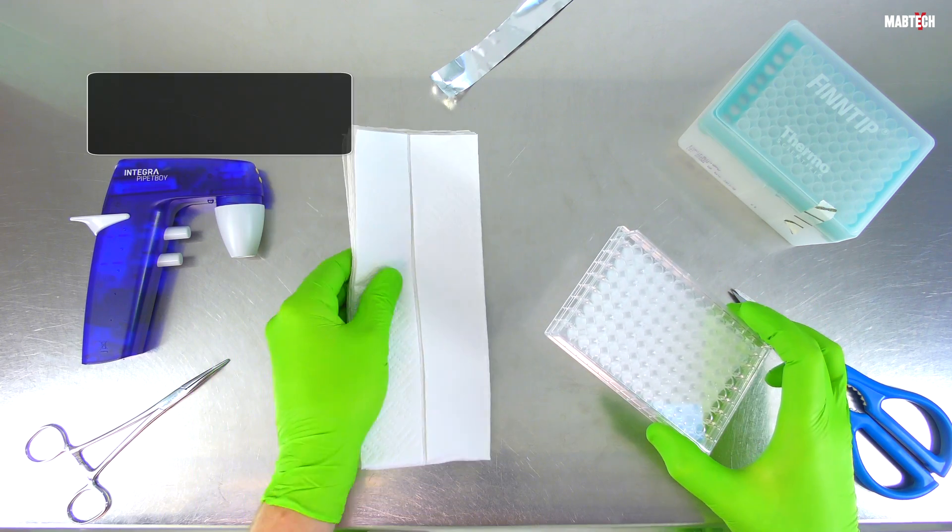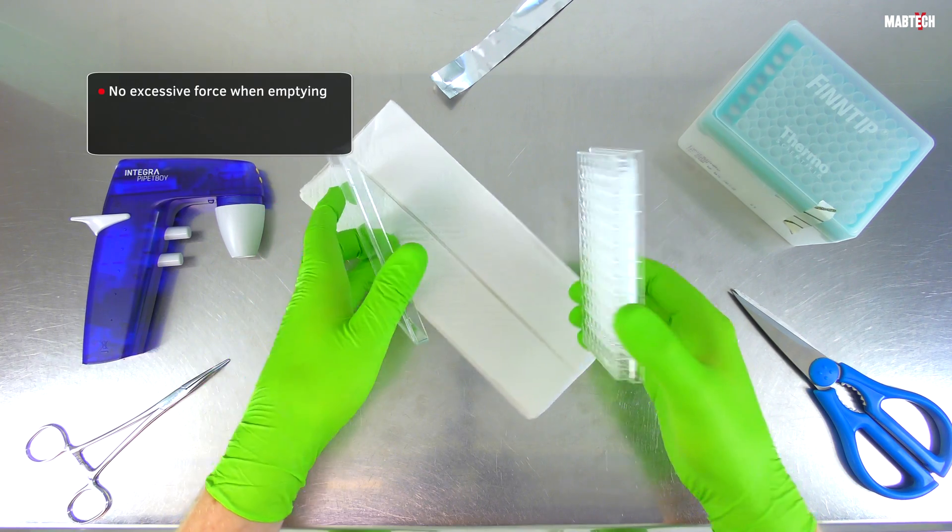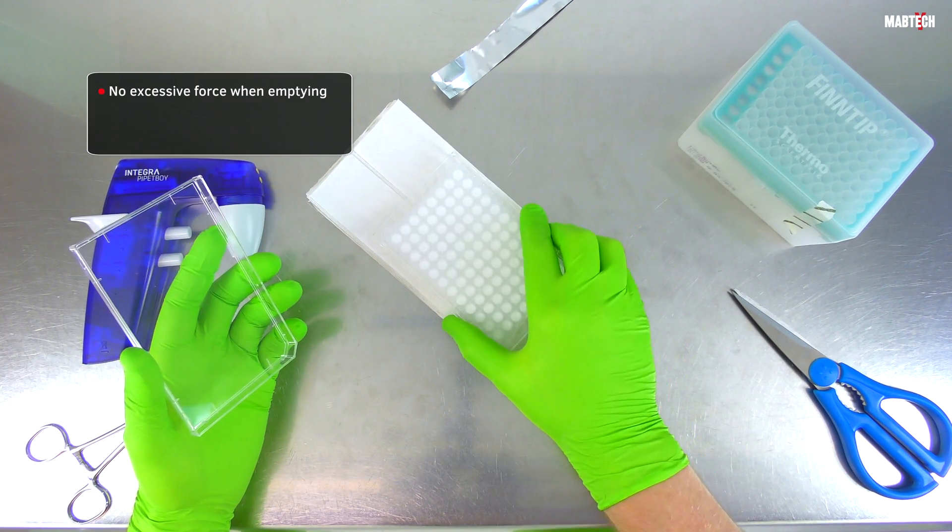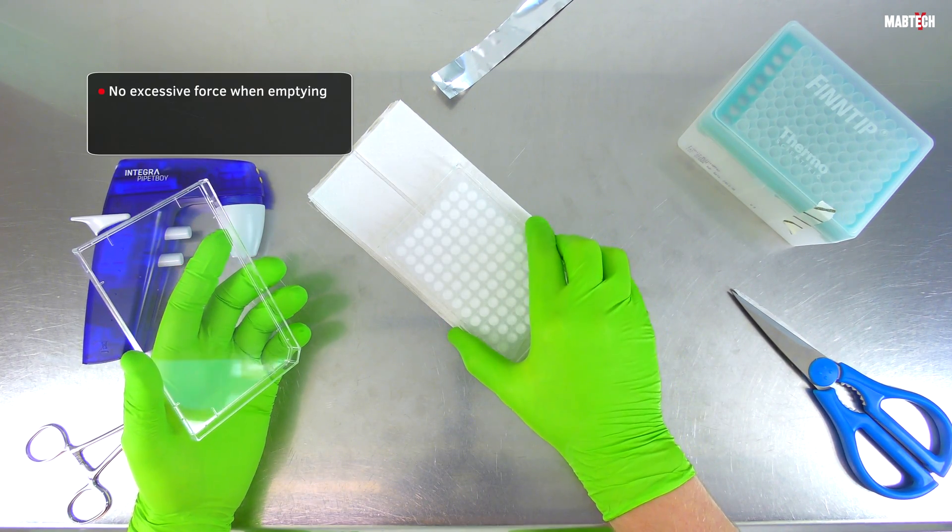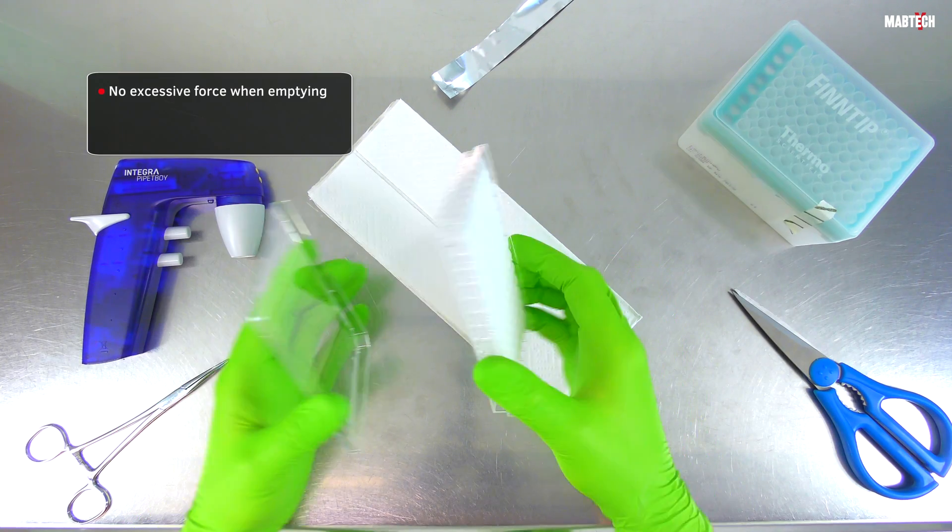Second, avoid using excessive force when emptying the plate. A firm tap is fine for removing small amounts of PBS or water, but you should never whip the plate ferociously into a hard surface with only thin sheets of paper covering it.